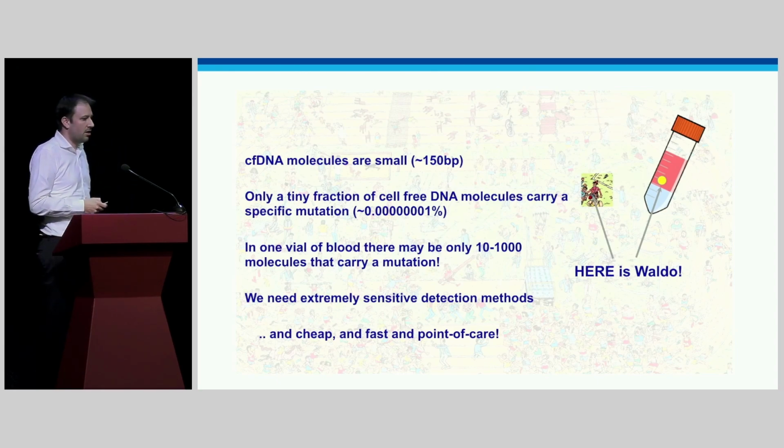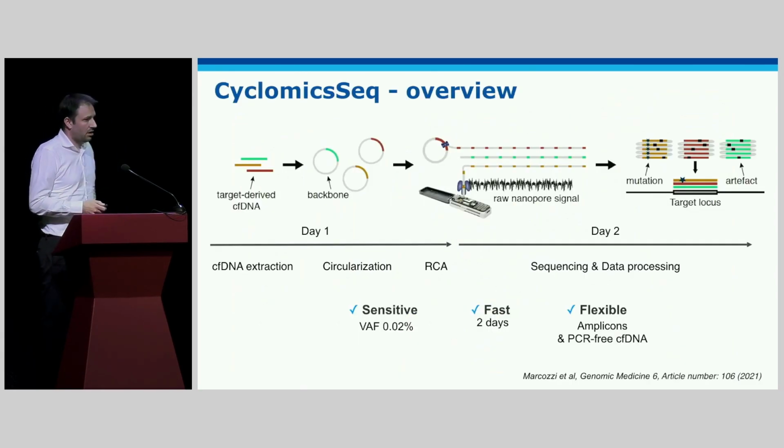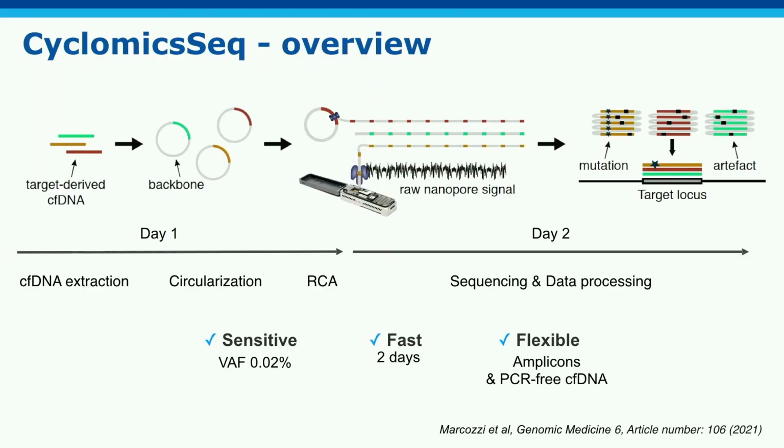And that's why we developed Cyclomic seq, which is a technology that we developed in our lab. It consists of a backbone sequence.